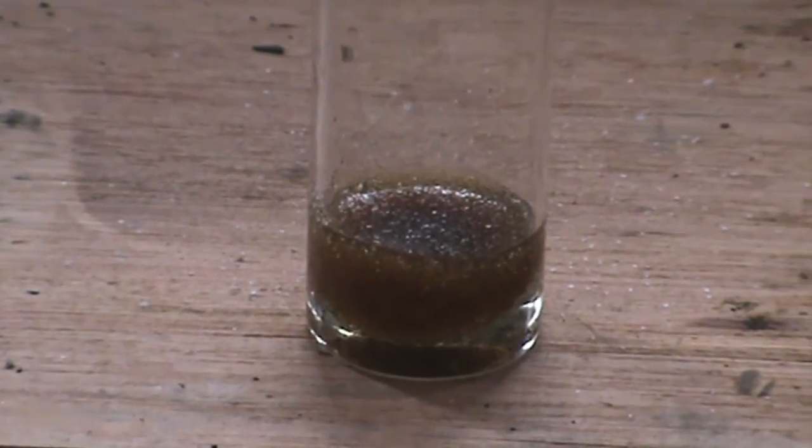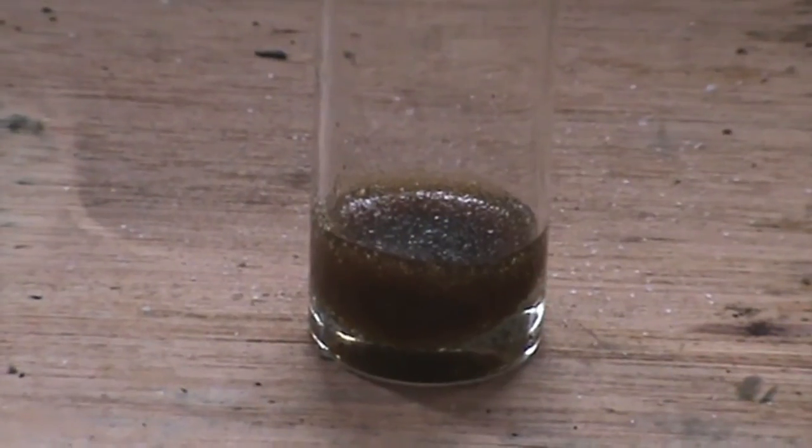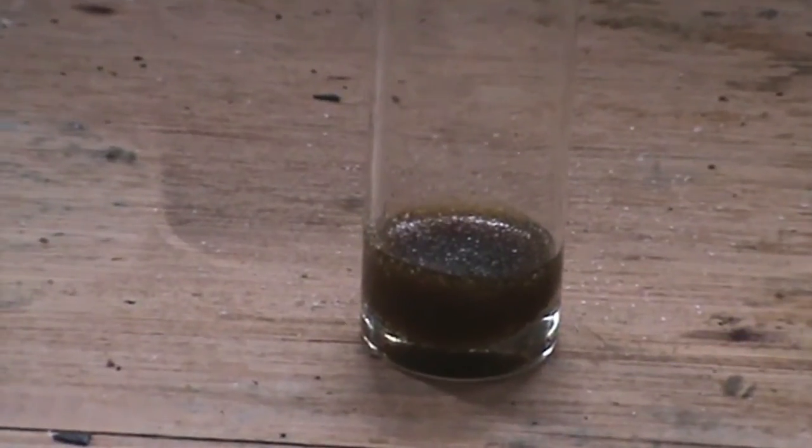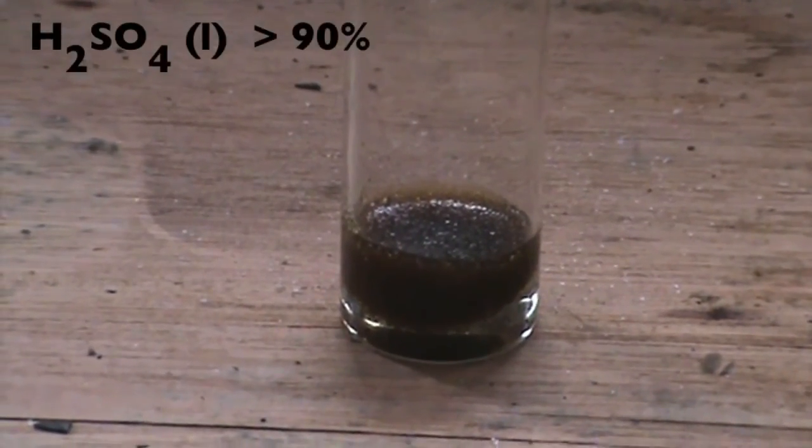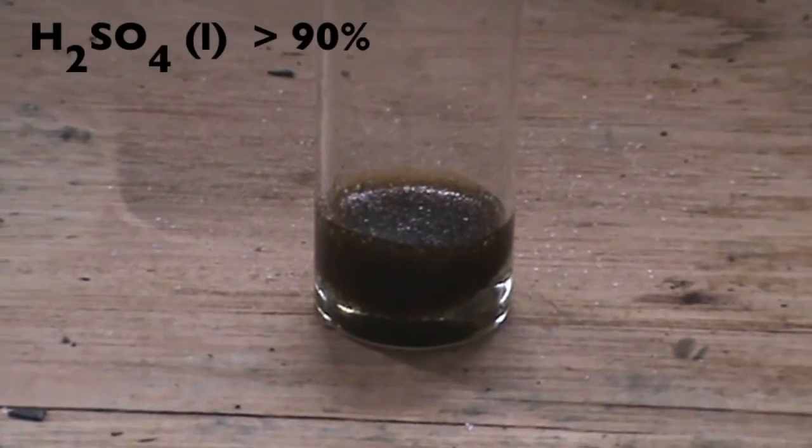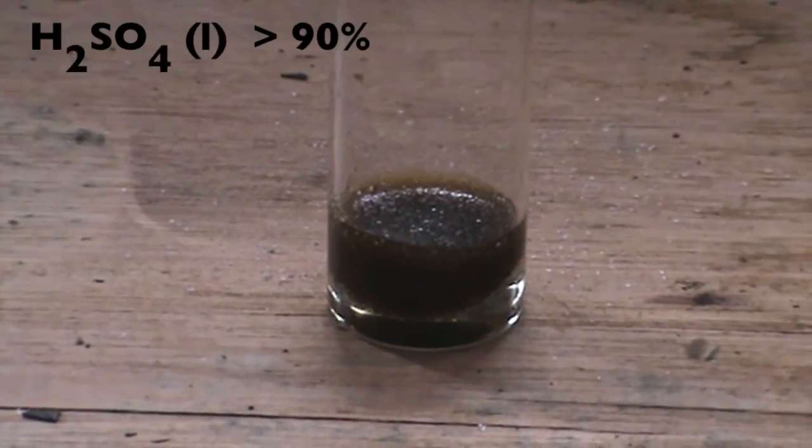As we can see, the sugar turns black. This happens because the concentrated sulfuric acid dehydrates the sugar, turning it into carbon. From this experiment, we can conclude that we were able to concentrate the sulfuric acid to more than 90%.